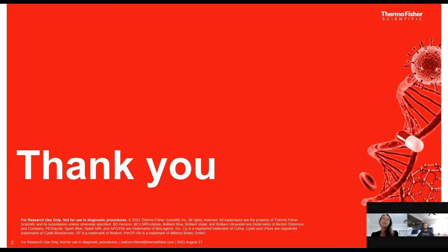What we do recommend is using an amine-based live dead stain, for instance, like your Invitrogen live dead dyes. These are the best ones to use with NovaFluors.